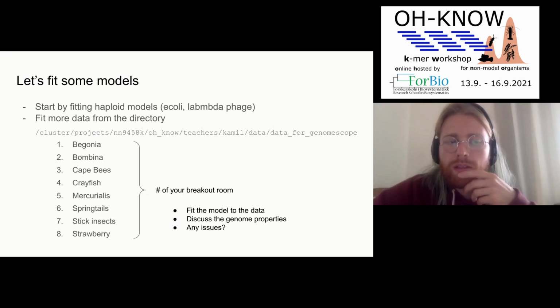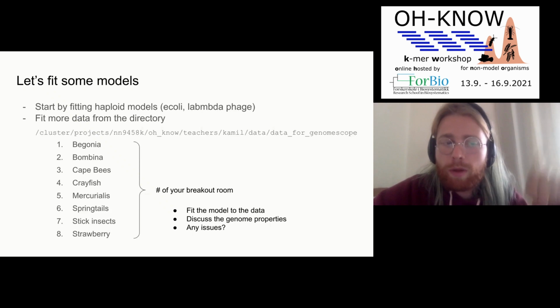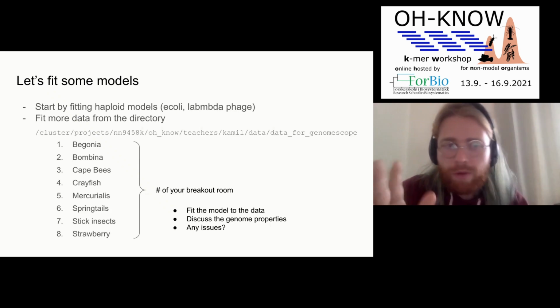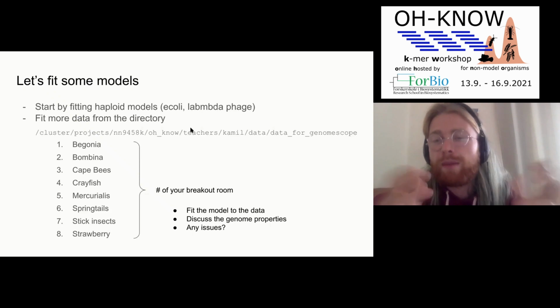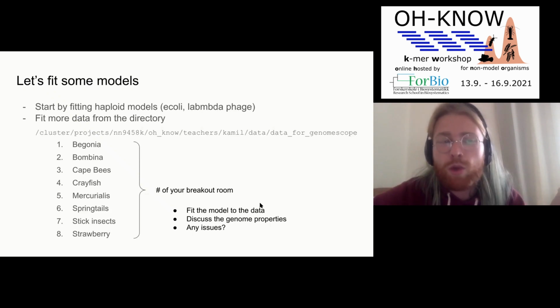So, I would encourage everybody to try multiple of those histograms, because fitting a Kmer model doesn't take that long. So let's now have 20 minutes of you fitting whatever you want, and then have 10 minutes where we share the histogram that is assigned to your group. If you are in breakout room 1, let's find among yourselves one peer that will show us the plot. Then breakout room 2 will have to show us their plot, etc. Is that all right?